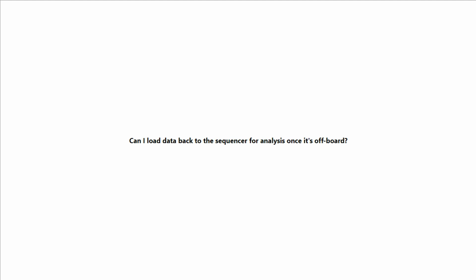All right, thank you, Deepthi. And so I see one last question in the chat. Feel free if you have any other last minute ones, but we'll go ahead and answer this last one for now. Are the reagents stored at room temperature? How long can you leave them out?